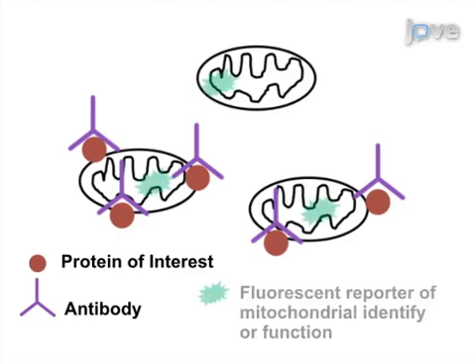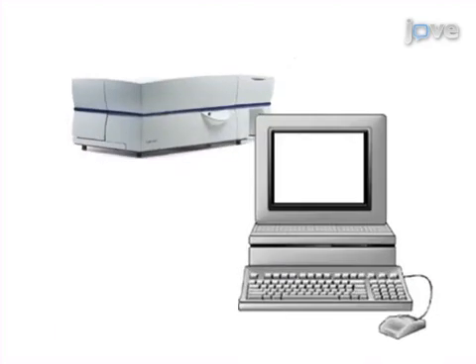The final step is to add fluorescent dyes to confirm mitochondrial identity or other functional parameters. Ultimately, flow cytometry is used to show the relative abundance of mitochondrial outer membranes throughout normal physiology or disease. The main advantage of this technique over existing methods, like microscopy, is that it permits high throughput and rapid quantitation of thousands of individual mitochondria.